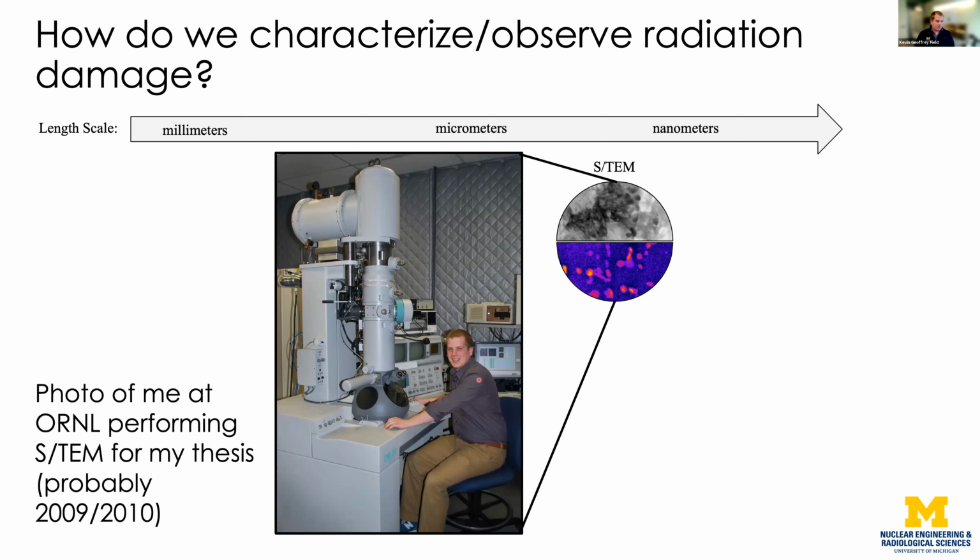So this was me in my first year as a student doing microscopy at Oak Ridge National Laboratory. That's a Philips CM200, a precursor to the FEI Tecnais that are now available. You can see the control interface is all physical buttons instead of computer clicking and stuff like that. I really love this system. This is one I actually wrote my thesis on effectively, but we've progressed quite a bit from here. But the principles that worked then also work now in today's environment.